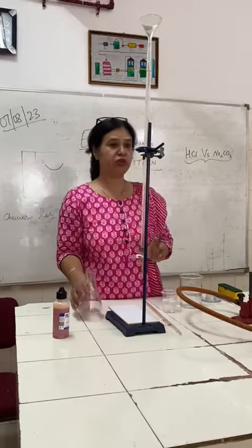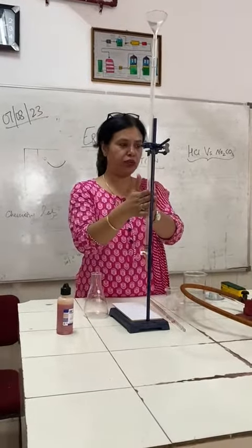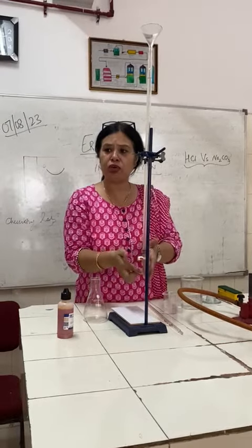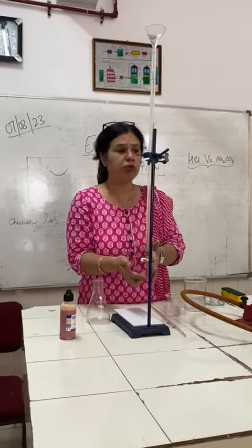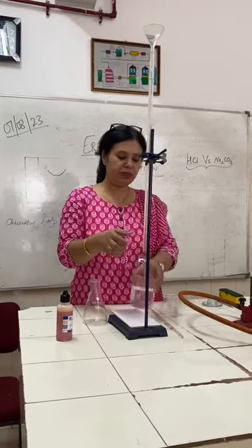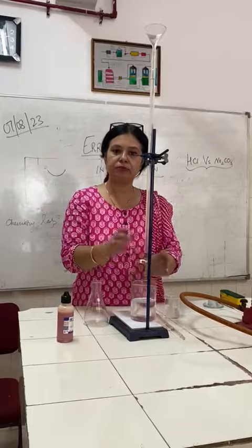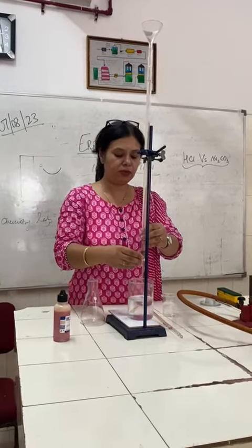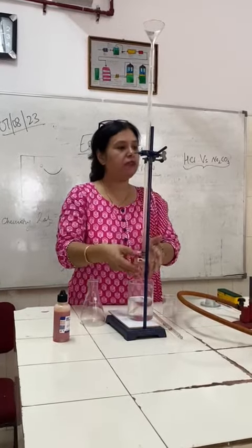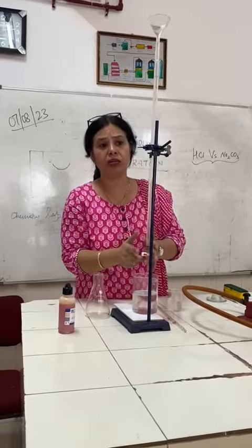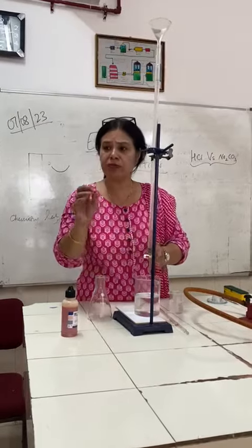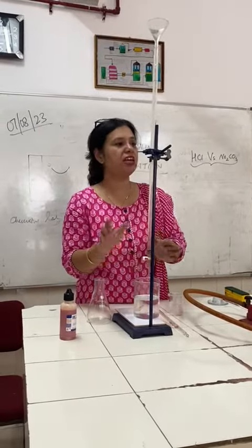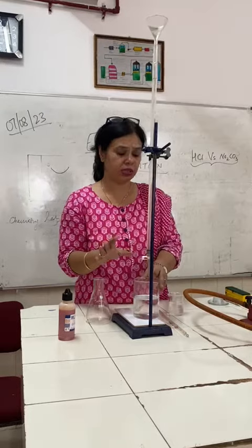The second mistake which we commonly do — we have to fill the apparatus up to the brim. Mostly students forget to fill it up to the brim. We have to put the beaker under the burette and open the tap so that it fills up to the brim with no bubble. Suppose a bubble is not going — it means it will be a constant error in all the readings. Do not worry about that.